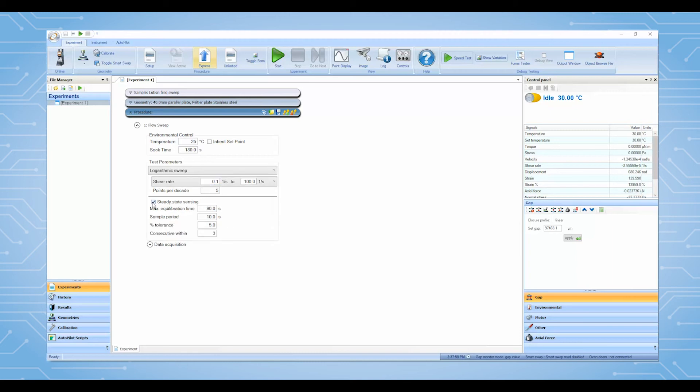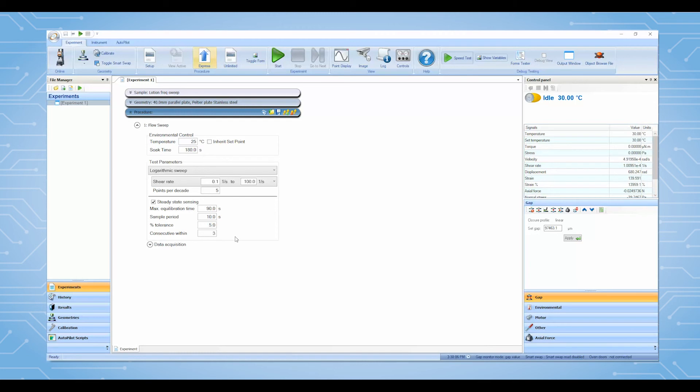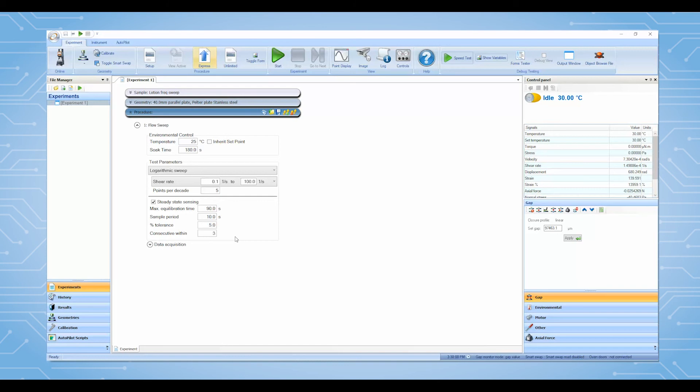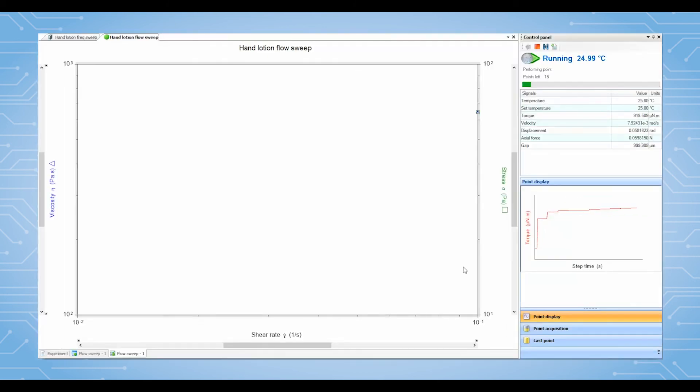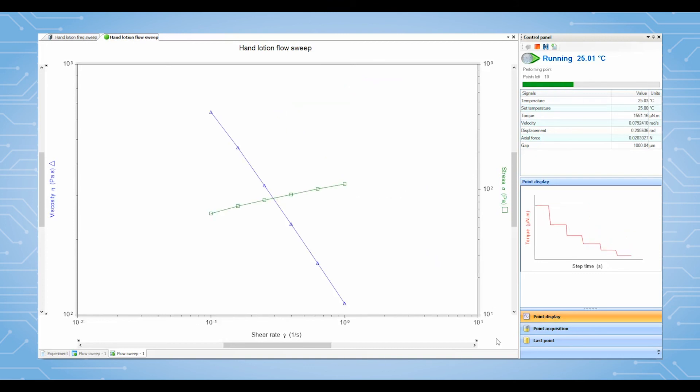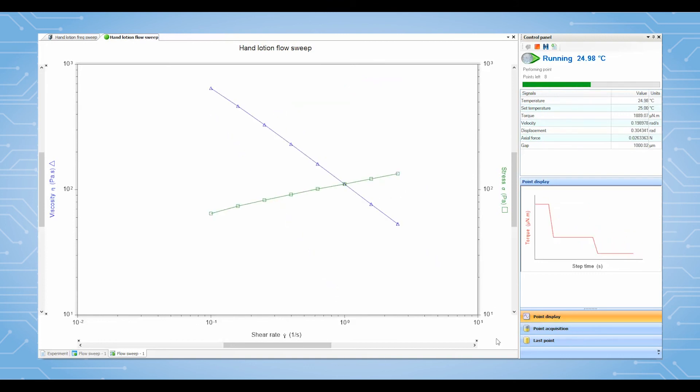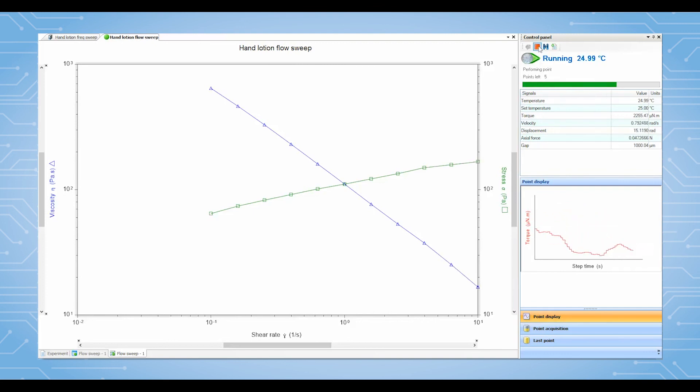Again, all default numbers under steady state sensing are good to use for most common samples within a moderate shear rate range such as from 0.1 to 100 reciprocal seconds. After the test is started, TRIO's will plot the results showing viscosity on Y1, stress on Y2 versus shear rate in log-log scale.